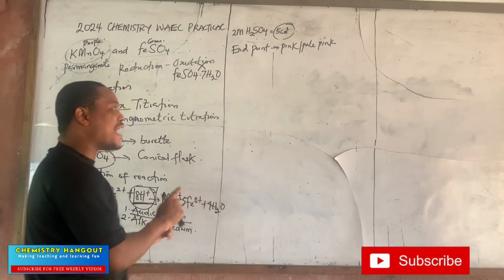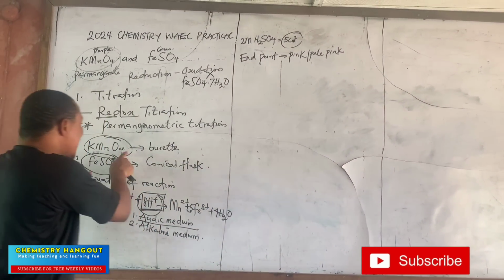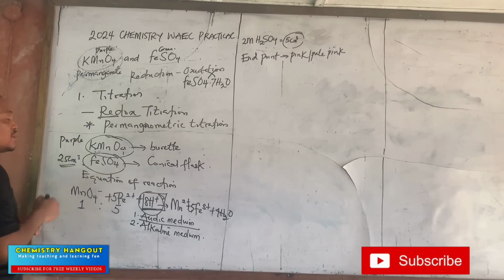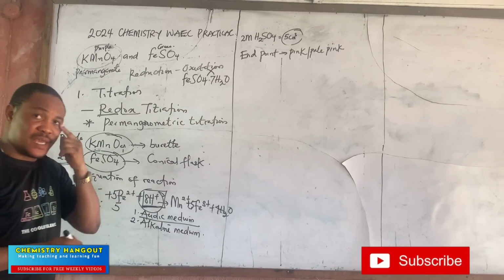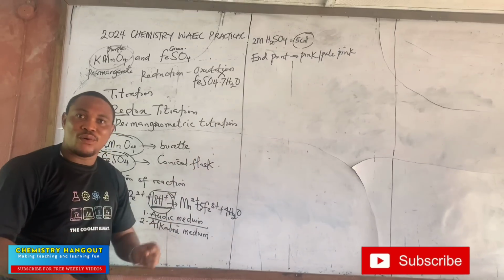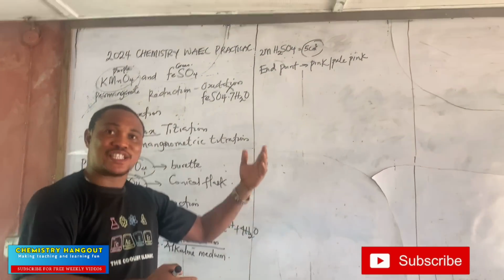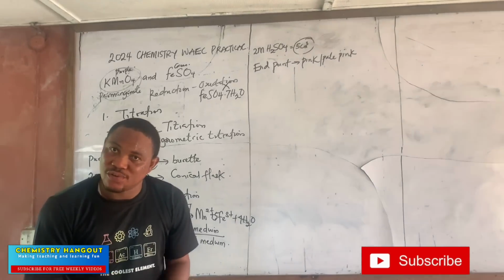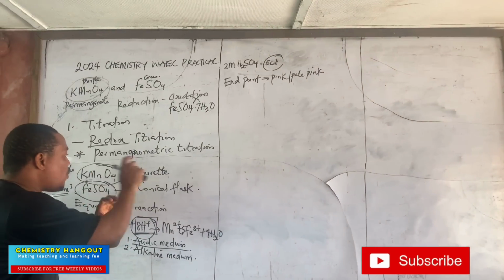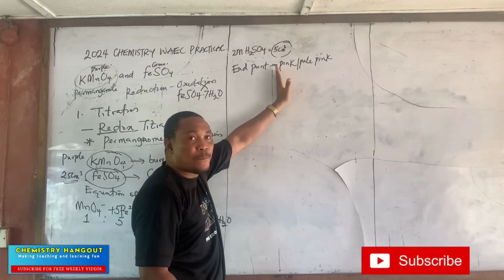Now, another question we can be asked from theory of practicals: in your burette, don't forget your KMnO4 is purple, which means it is colored. They can ask 2 questions from here. One of the questions is, why is it that there is no indicator? Because in acid-base titration, don't forget, we are using indicator, either methyl orange or phenolphthalein. Is that not true? Definitely. But here, why is it that we are not using indicator? Because we are looking for a pale pink or pink. So there is no indicator.